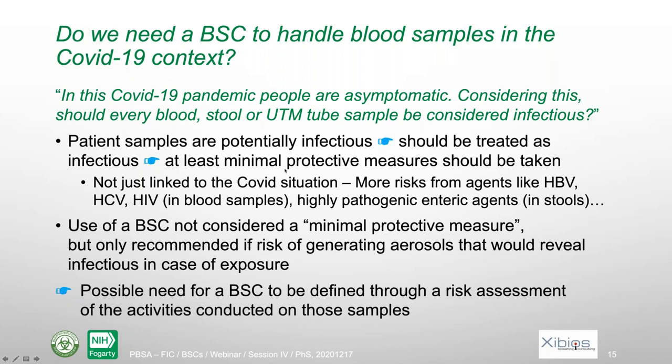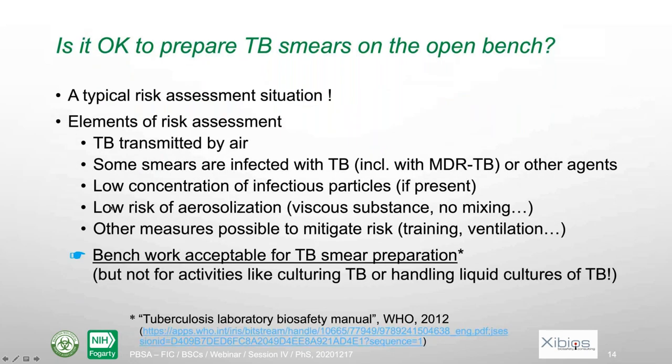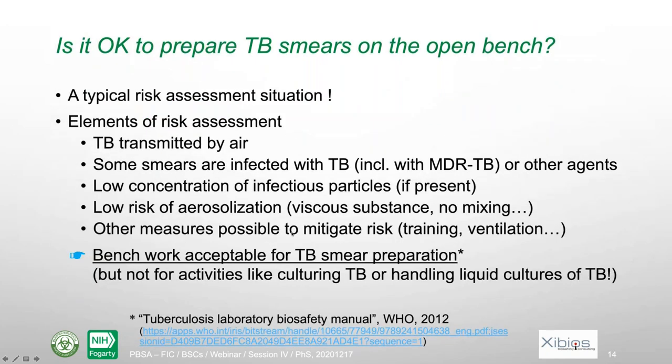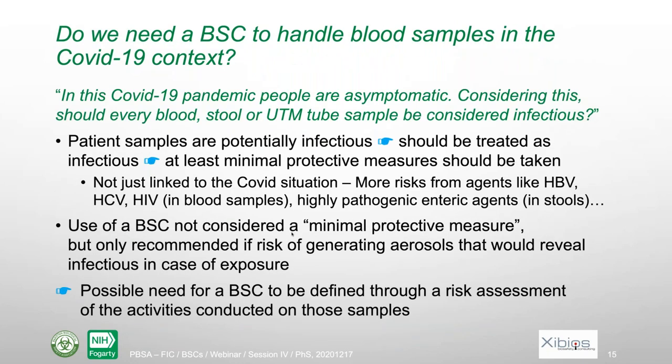So, we need to take minimal protective measures against those very hazardous agents, which are HBV, HCV, and so on. Do we use a biosafety cabinet or not? Actually, a biosafety cabinet is something which is sophisticated and it's not considered a minimal protective measure. A biosafety cabinet would only be recommended if there is a risk of generating aerosols that would cause infections in case of exposure.